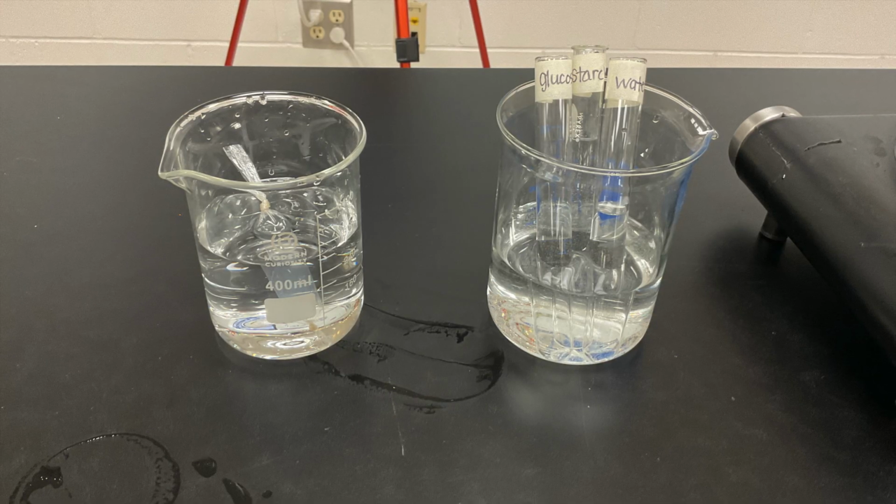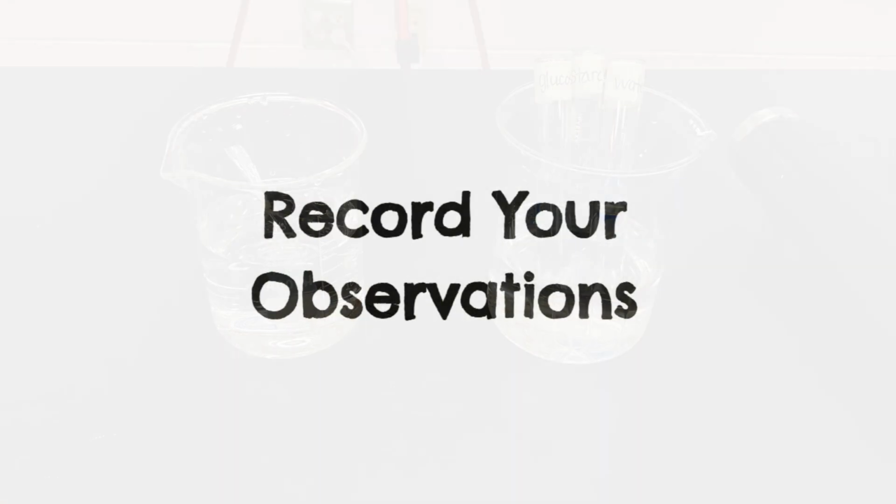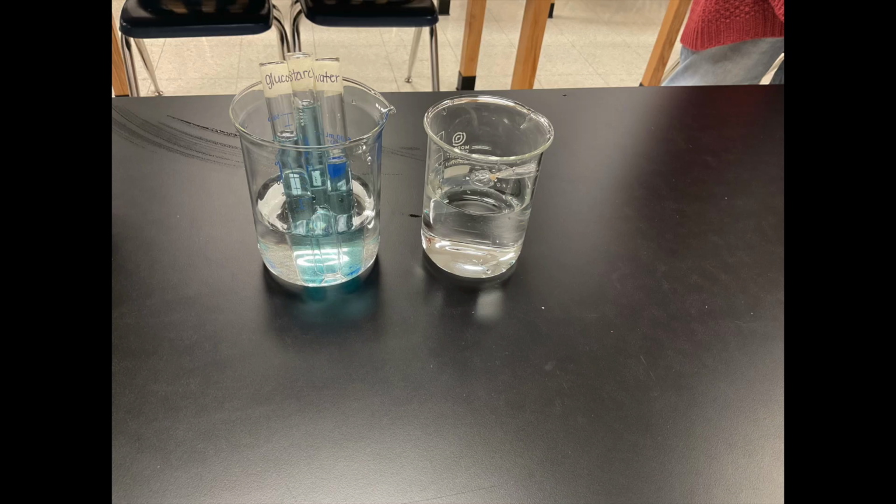Pause the video and take a minute to record your initial observations of the color of the solutions inside of the beaker and the test tubes. Now let's focus on the beaker with the test tubes. You will notice that the color of the liquid inside of the test tubes has changed. This is because we added 2 milliliters of Benedict's solution in each of the test tubes. Pause the video and record your observations on the change of color.